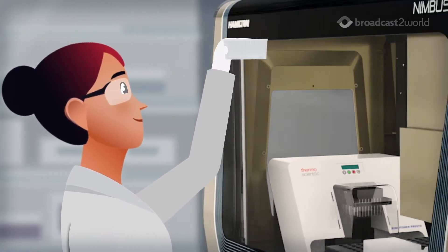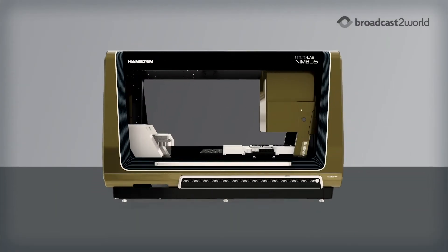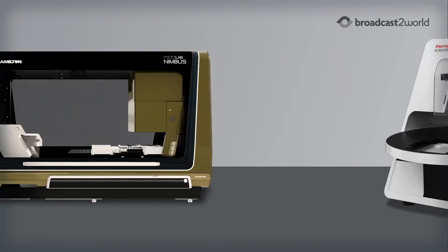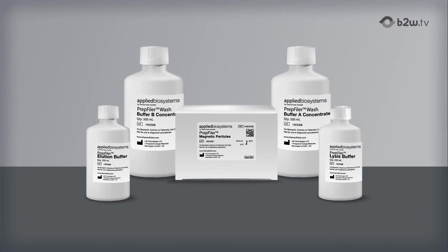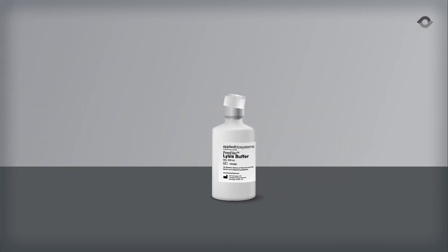The system is comprised of three key parts: Hamilton ID Nimbus Liquid Handler, Thermo Scientific Kingfisher Presto Purification System, and a pre-validated script optimized for Applied Biosystems Prep Filer Forensic DNA Extraction Chemistry.